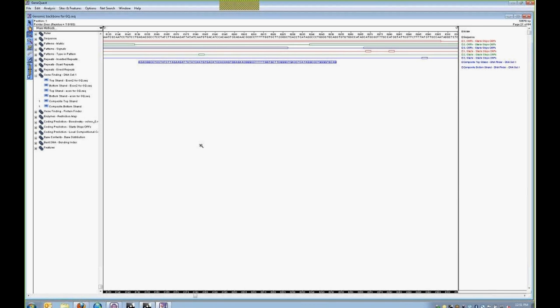And you can do that with all sorts of DNA. So if you also have a protein that you want to search against, you can use the gene finding protein finder as well. So again, that covers the various workflows that we wanted to show you today for both the Megaline and the GeneQuest applications. So at this point, I'll hand it back over to Katie.